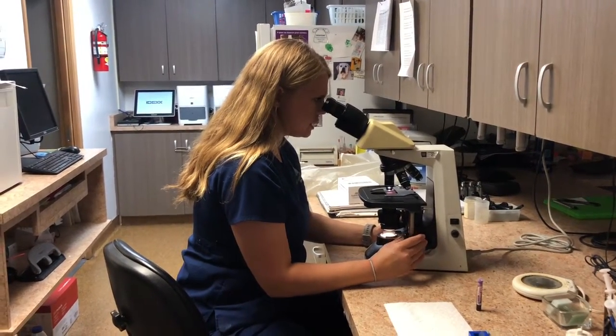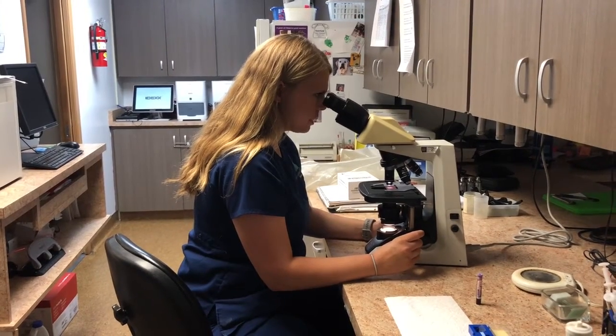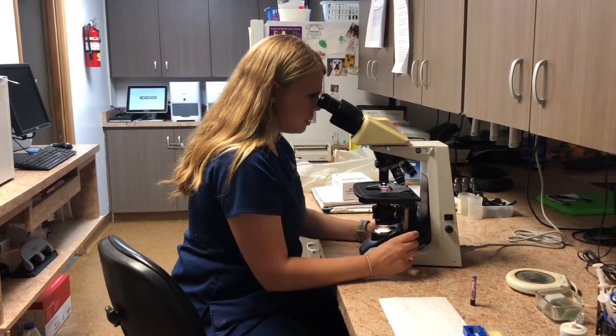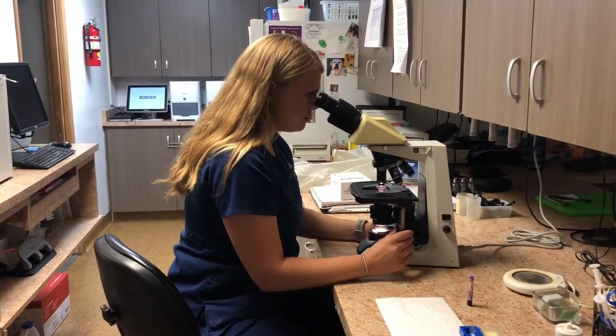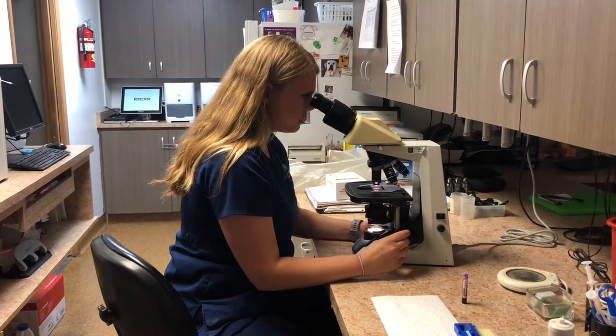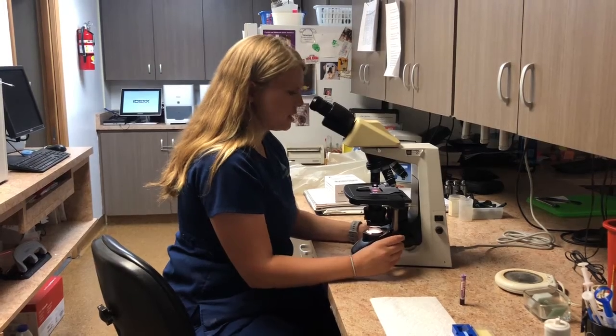Perfect. And I am seeing none of the moving microfilaria as I just finish up here. And even though I am getting a negative result on here, this is a very small blood sample. I would want to actually run a full heartworm test or the modified Knott's test to actually fully see, just since this is such a small sample.